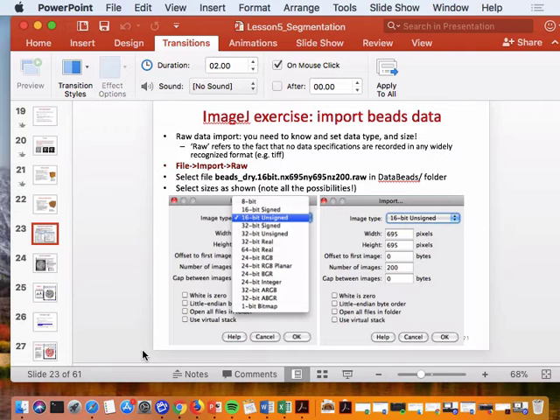I'd say that filtering tools are more widely available and implemented than segmentation tools are. Quality segmentation methods could be much more time consuming than filtering is. So I'd filter rather well and then move on to segmentation. We're going to have an example with the carbonate samples that you're playing with right now. They have some interesting features, and you have to denoise them in order to use segmentation properly. So yes, filtering is time well spent investigating.